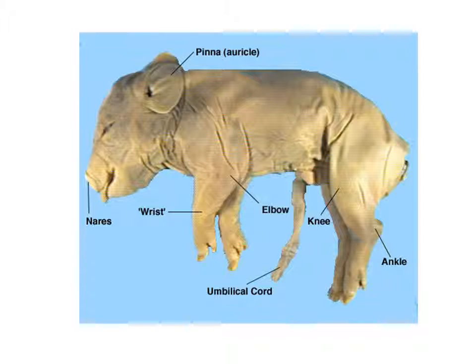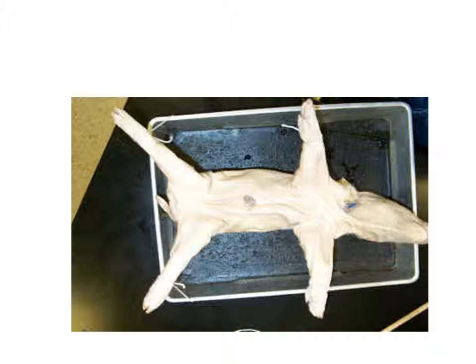There we got it. Do compare their anatomy to yours in terms of joints. Where's their wrist? Where's your wrist? Where's their elbow? Where's your elbow? Does it all bend the same way? It's one of the exercises in the books. Do that. It's not necessarily intuitive. Make sure you rope your pig down.